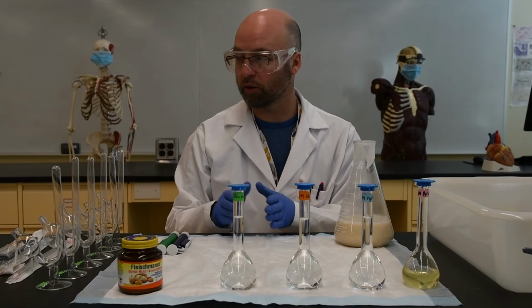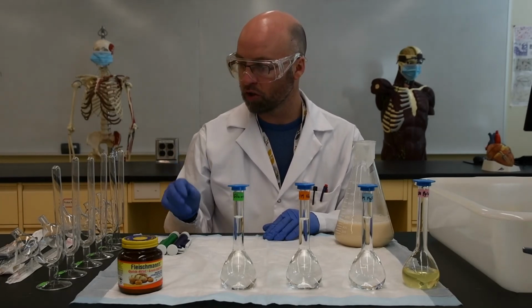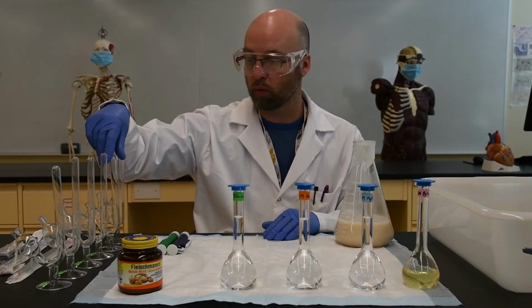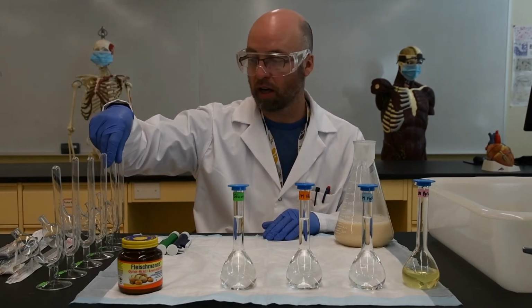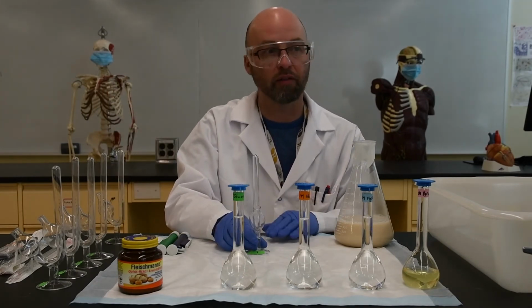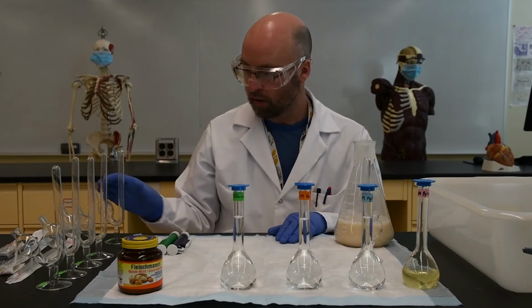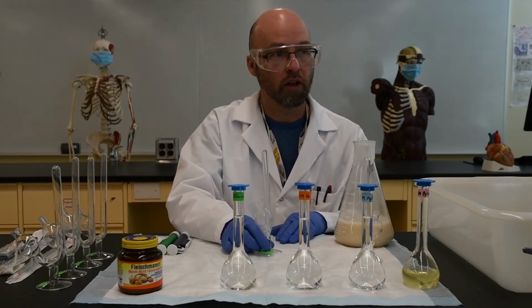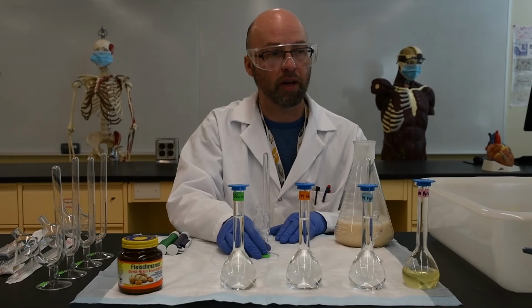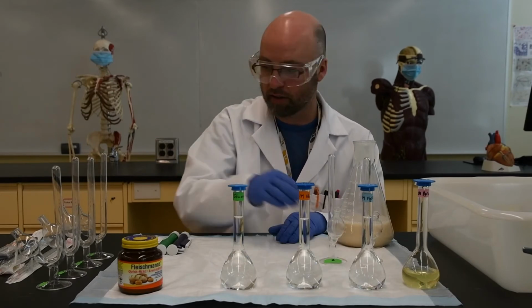So in your handout, you'll see the ingredients for each of the 6 experimental tubes. So just to go through them very quickly, I won't bore you by filling them all in front of you, we have tube number 1 that's going to have 2.5 ml of glucose, 5 ml of water, and 10 ml of the yeast. Next up is tube number 2. This one's going to have 5 ml of magnesium sulfate, 2.5 ml of the glucose, and 10 ml of yeast.